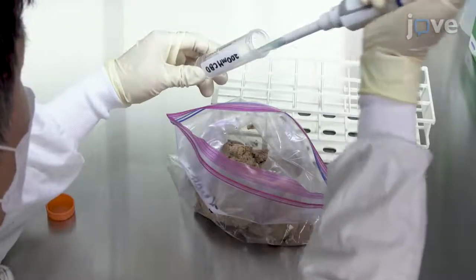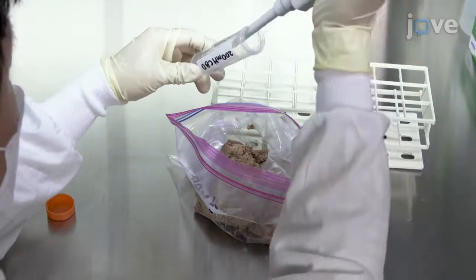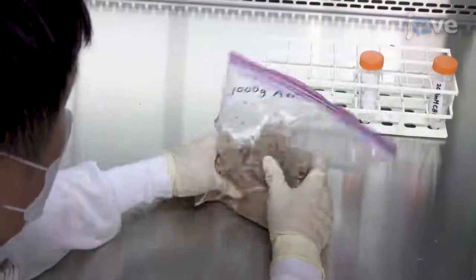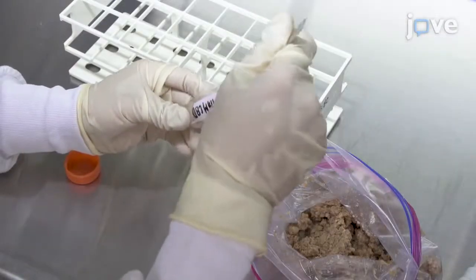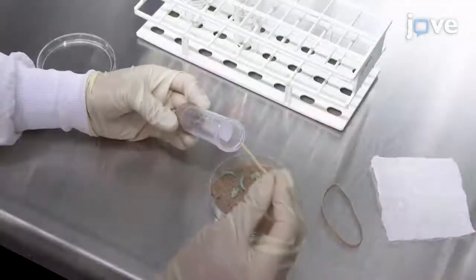Add 5 milliliters and 10 milliliters of the 200-millimolar cannabidiol stock solution to 1,000 grams of an artificial diet for 1 millimolar and 2 millimolar of cannabidiol, respectively. Dispense 20 grams of control, vehicle, and cannabidiol-containing media to the bottom of the 50-milliliter tube.